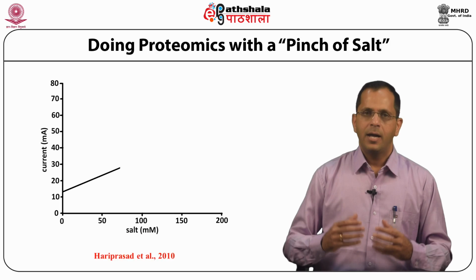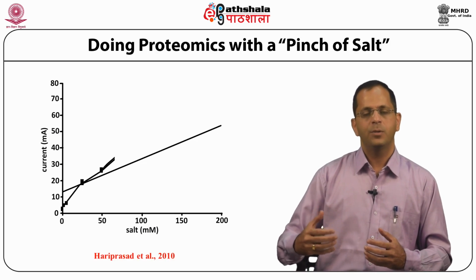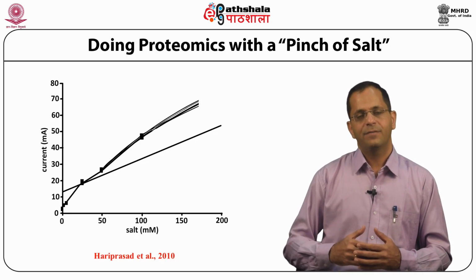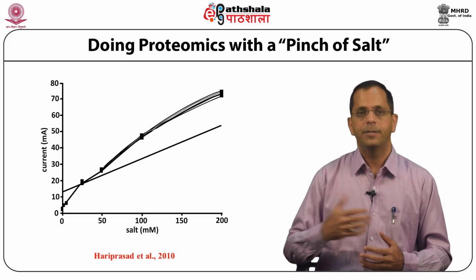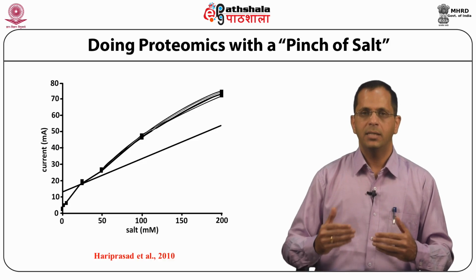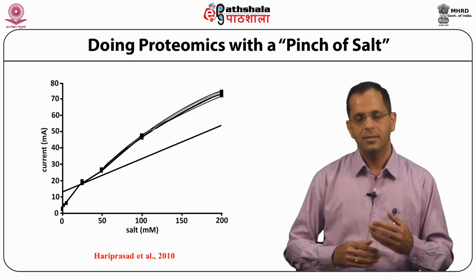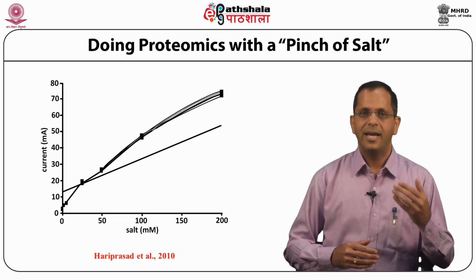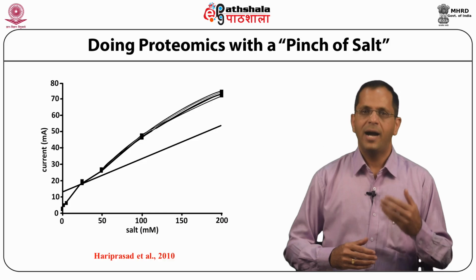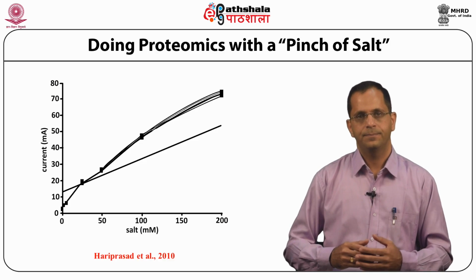Proteomics can be done, but there are a few troubleshooting points, especially from the aspect of salt. So let us try to understand how we can understand the salt contamination. Before that, let's just go through the effect and result of high ionic content on protein electrophoresis.